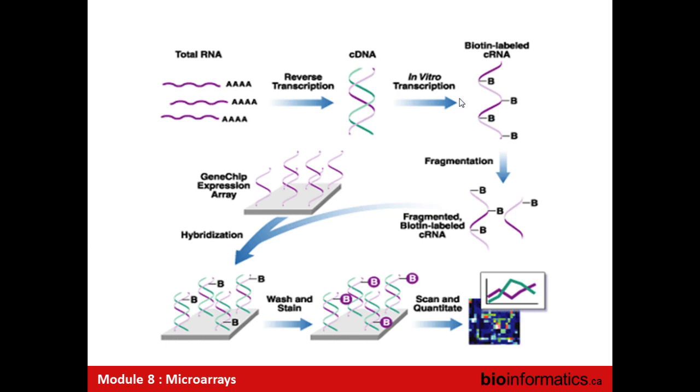So I didn't know this until about 4 years ago when in this class somebody pointed this out to me and I went up and realized this is entirely true and did some research on it. Single-stranded DNA is not stable. Single-stranded DNA is an unhappy molecule. Single-stranded RNA is a perfectly happy molecule. So it's much easier to store and save cRNA than it is to store and save cDNA, especially if you're going to be doing it in conditions that are not prone to Watson and Crick base pairing, double strands.